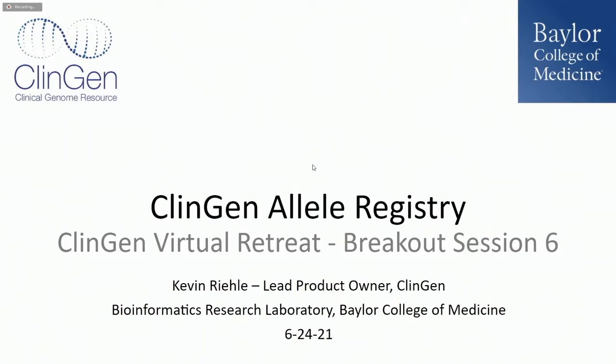I presented this morning on the ClinGen data access as it related to APIs and streaming services, and I mentioned the Allele Registry. So I'm going to touch upon the introductory materials a little bit. If you attended that, it'll be a little bit of similarity, but I'm actually going to be talking about a lot of the other functionalities of the Allele Registry, mostly from the user interface perspective.